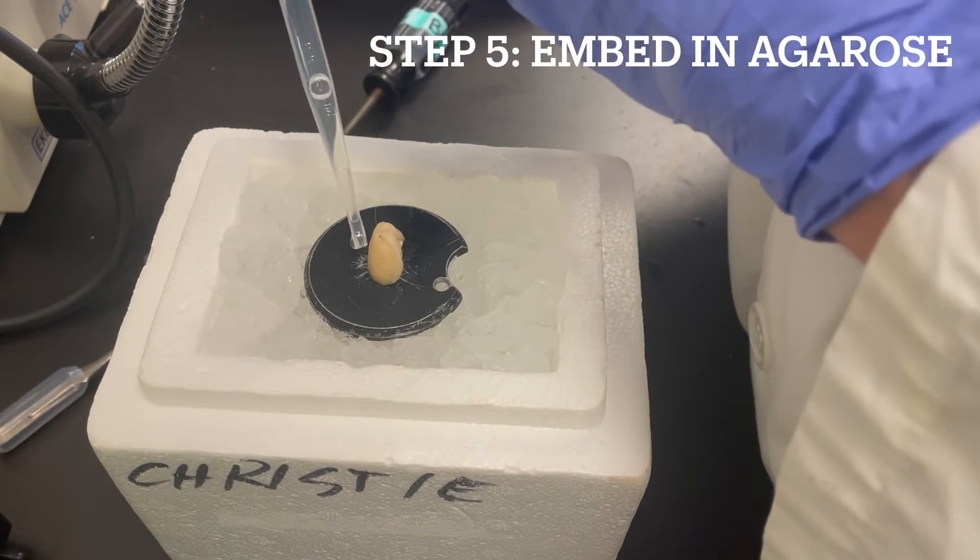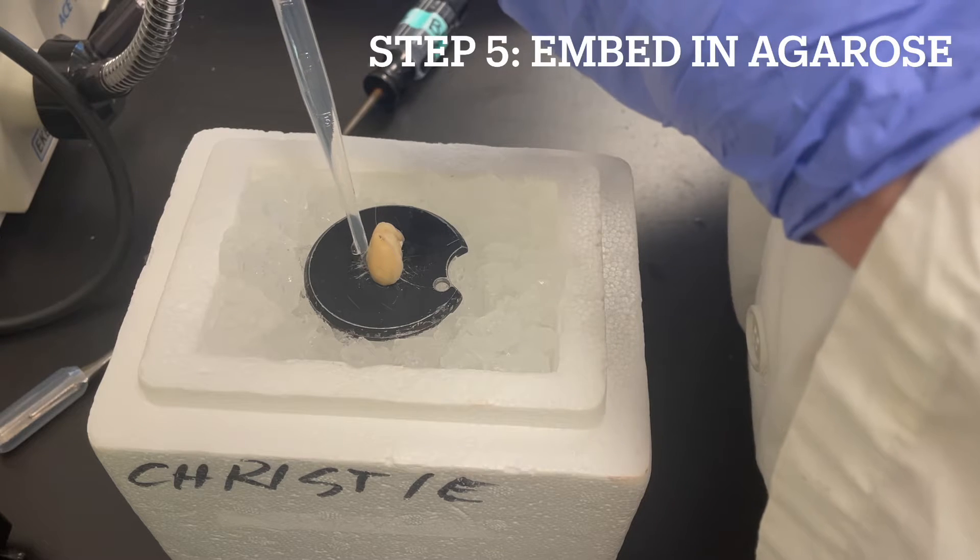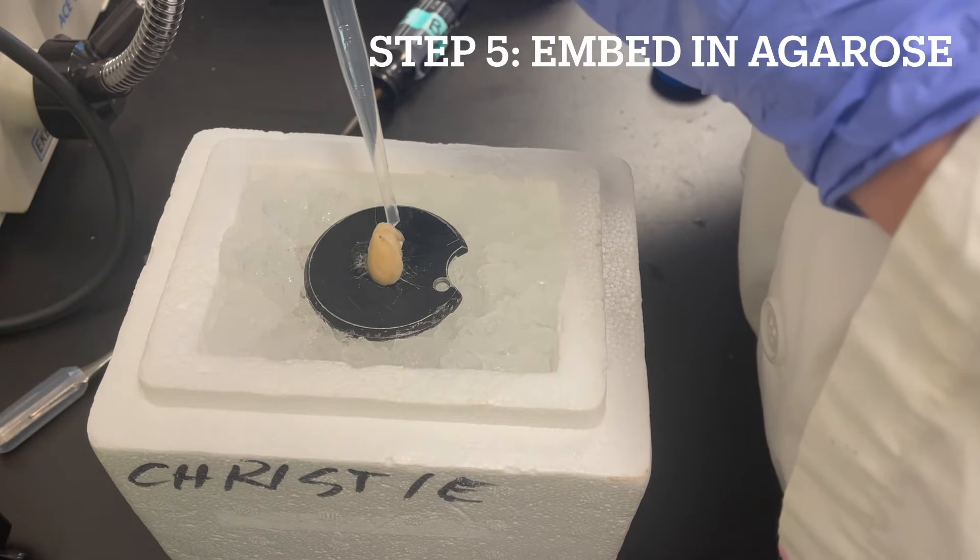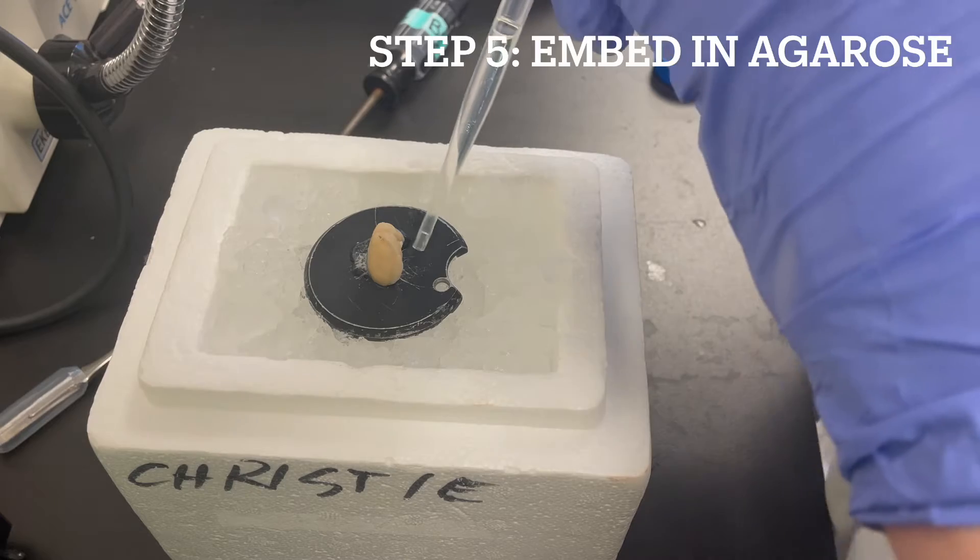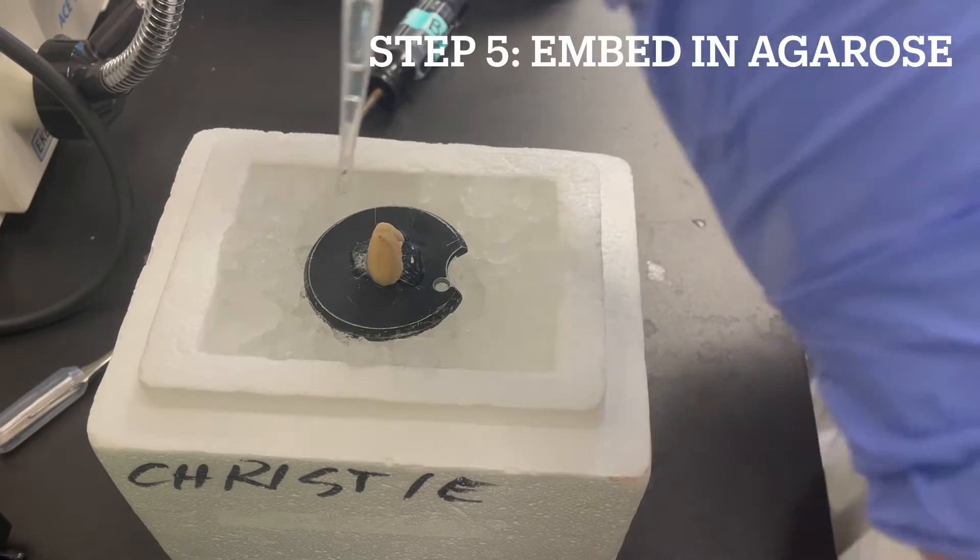Once the super glue has dried and the brain is securely attached to the metal stage, we are going to embed the brain in agarose, which helps guide the blade through the tissue, ensuring precise and smooth cuts.